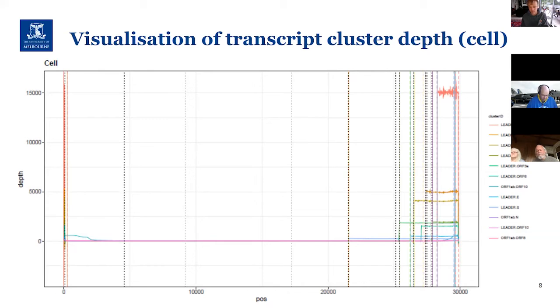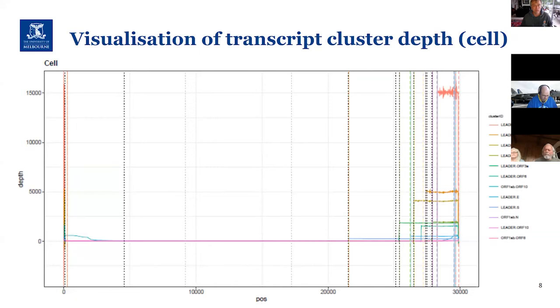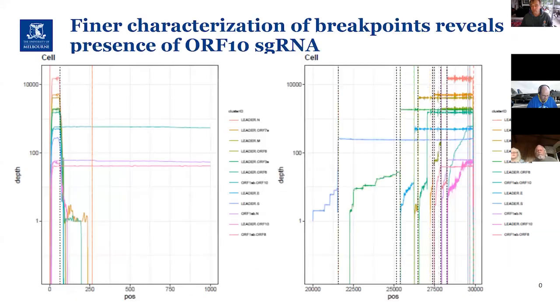And there's one you'll see right on the 5' end, or leader sequence, as well. So that controls where this splicing process occurs. And so you can see that each of these open reading frames has a very sharp breakpoint at which that occurs. You might notice on the left-hand side that there's this blue line which extends out a little bit, and I'll talk about this in a second. So we do see some subset of reads which have an extended 5' sequence.